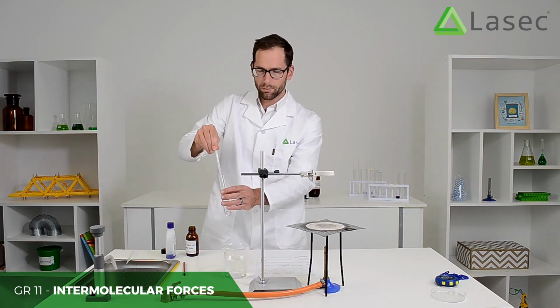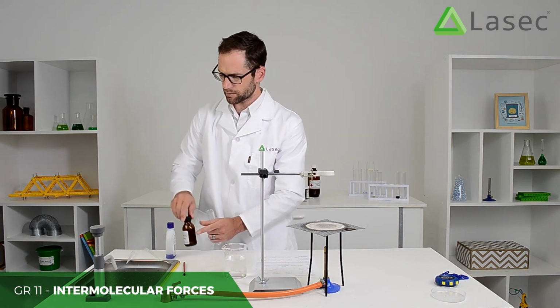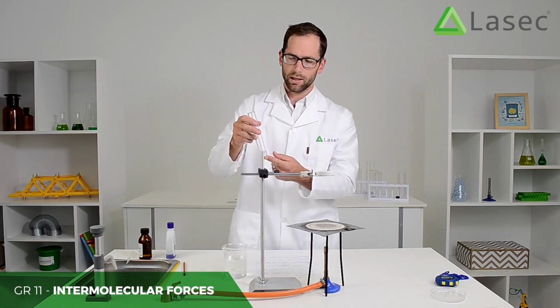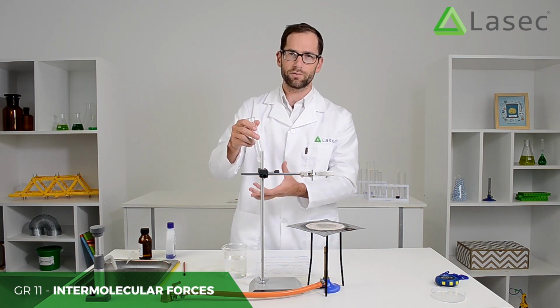That should be fine, but now I don't want to heat this directly on the flame. Ethanol is very flammable, and if I heat it directly on the flame, there's going to be a lot of heat directed at one point, and that direct heat is just not going to be safe. Plus the actual flame itself could set off the fumes.